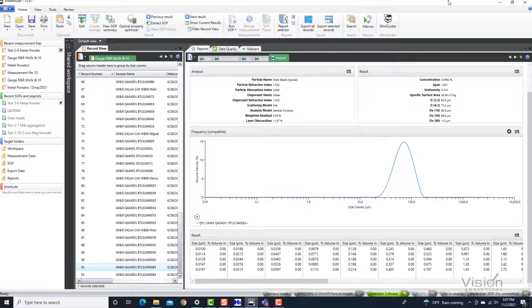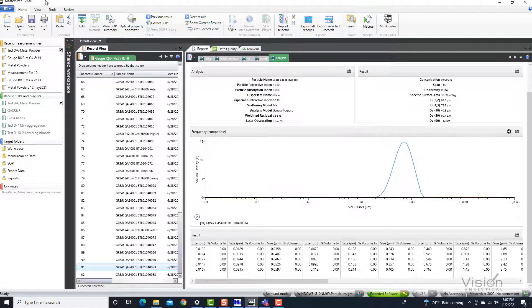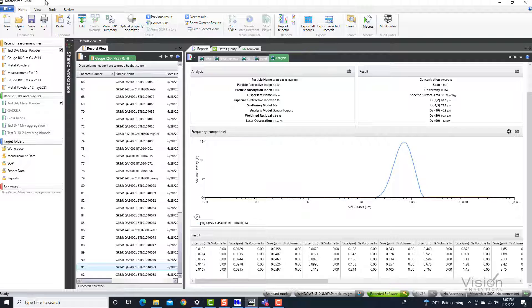What we have here is a particle size distribution of a sample that was analyzed on the Masterciser 3000. The Hydro Insight was also attached as an accessory in line to the Masterciser 3000 to complement the information with shape information.